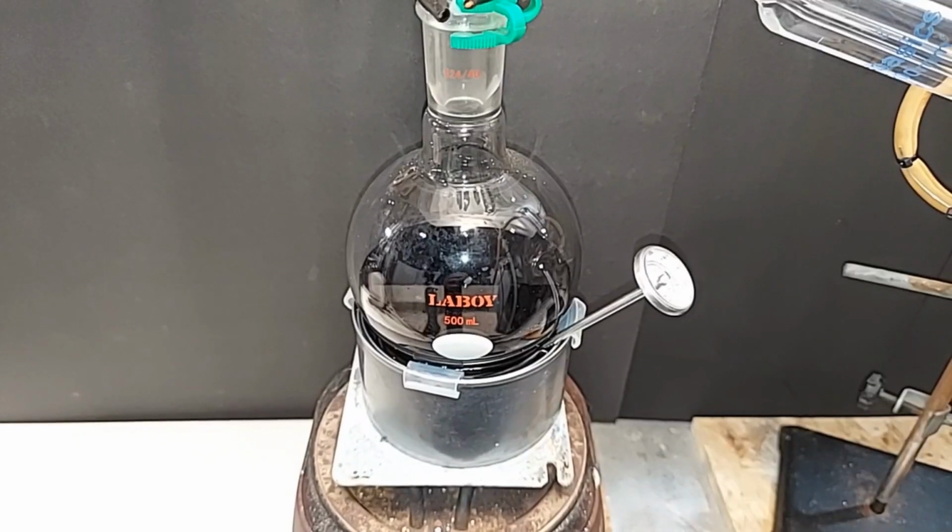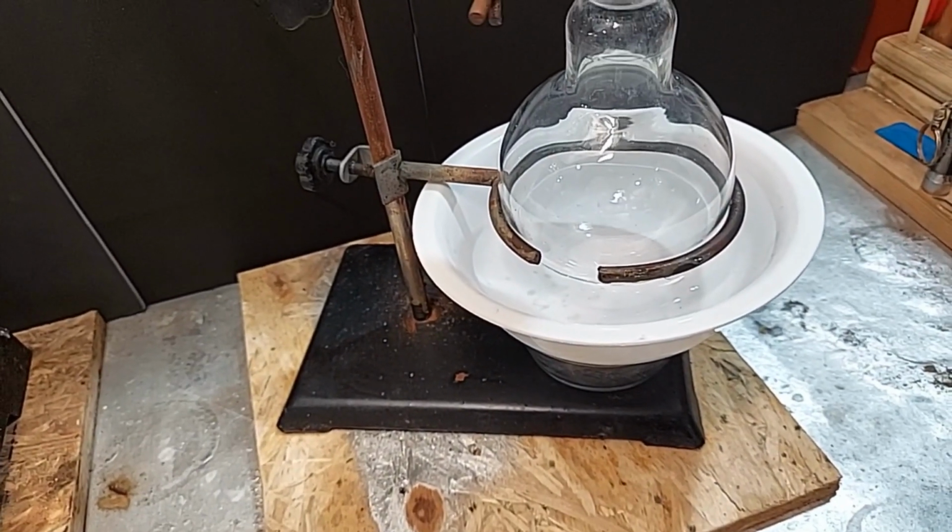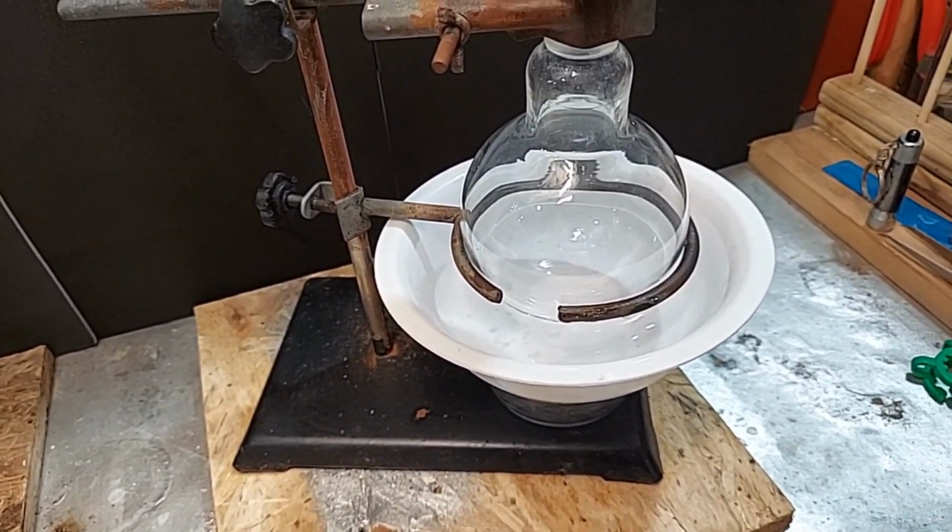I put a thermometer in there to measure the temperature of the oil because obviously that will change first before any vapors do. So we're all set. I'm going to turn this on and I'll be back periodically. The temperature is creeping up nice and slowly there, watching it closely. And on this end, I've got a bowl there with some water. I'll add ice once it actually starts dripping in there.